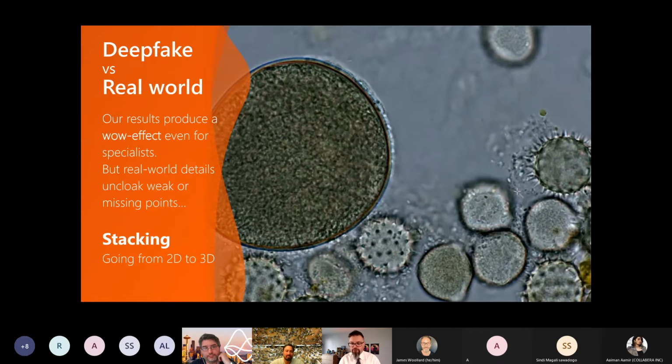We needed to know how a laboratory technician sees the pictures and how he works every day. And the thing we need to implement in the algorithm is what we call stacking. The laboratory technician moves the lamellas under the microscope to simulate a kind of 3D of the pollens, because it's not just 2D, it's not an image, it's something on a glass under a microscope.